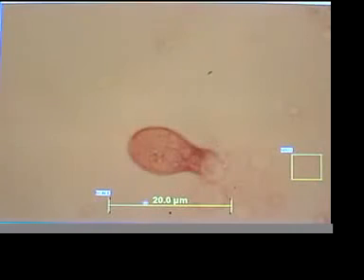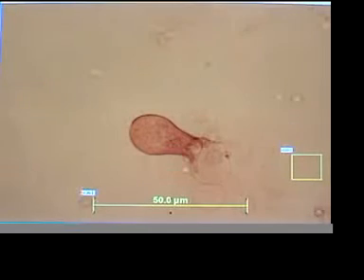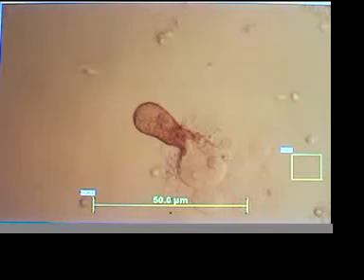Let me check the scale. We'll fix the scale for you here. And he is devitalizing at 927 hertz. There he goes. Now you can see a little more action happening. This is real time. Let's see if we can get that sort of contrast effect we had before. Oh, I don't want to interrupt this process. There we go. Now you see a little surface texture. I'm cheating a little touch of red filter in there.